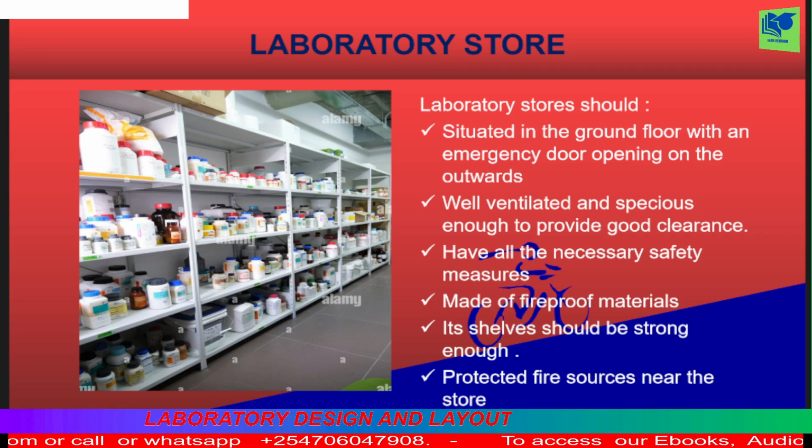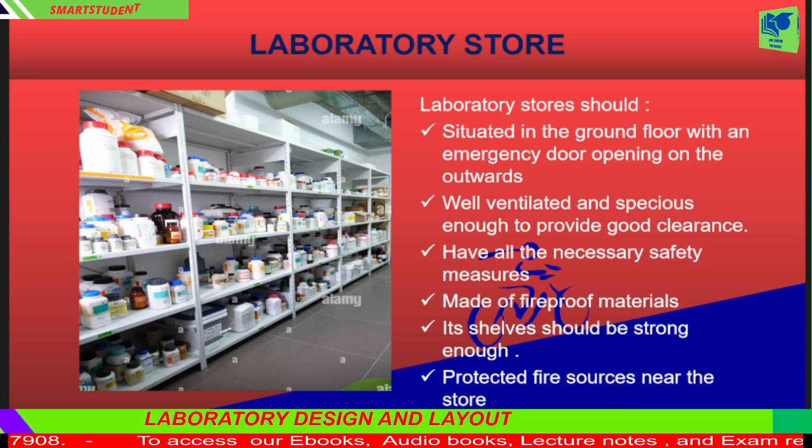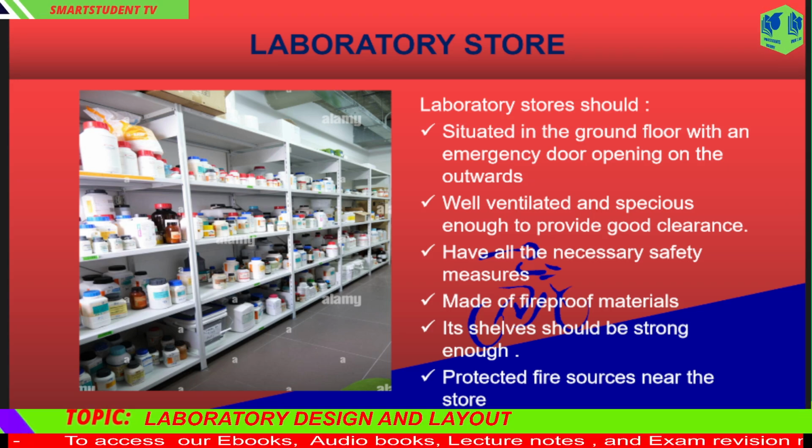4. Be made of fireproof materials, and its shelves should be strong enough to be able to withstand the weight of chemicals stored on them. 6. Discourage smoking and fire sources near the store.